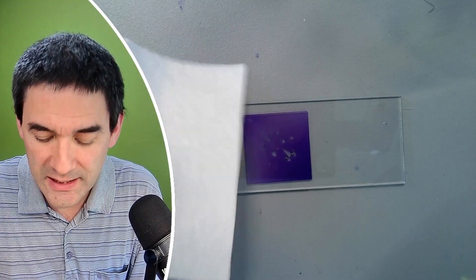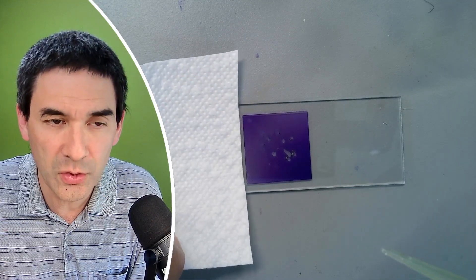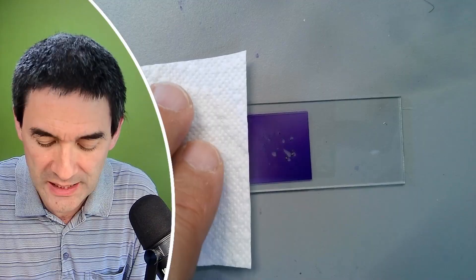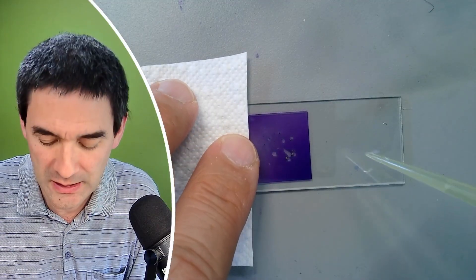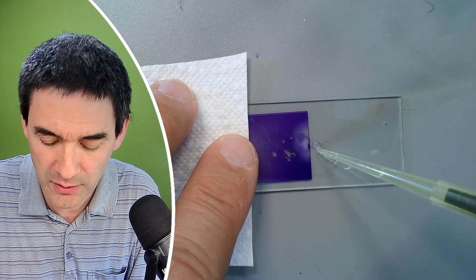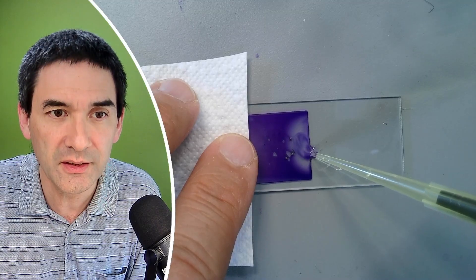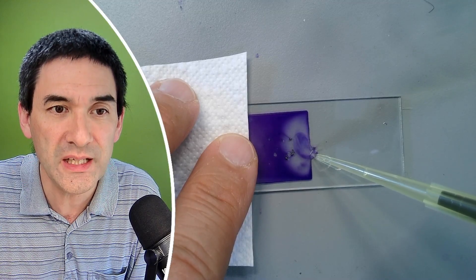In order to remove any excess stain, you can apply a tissue paper or filter paper on one edge here, and you press down a little bit and then the other edge you add a little bit of water. You can see that the water flows in.